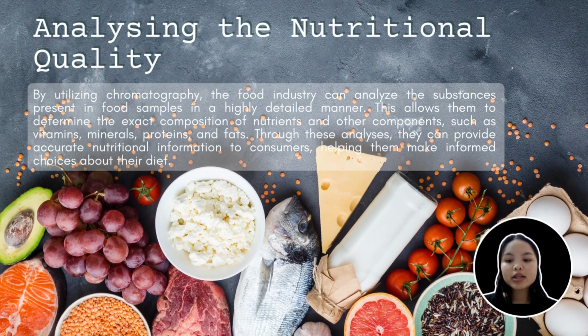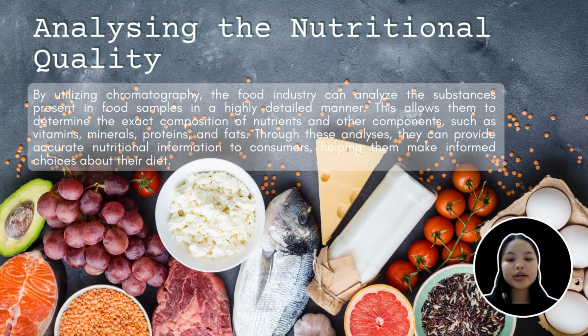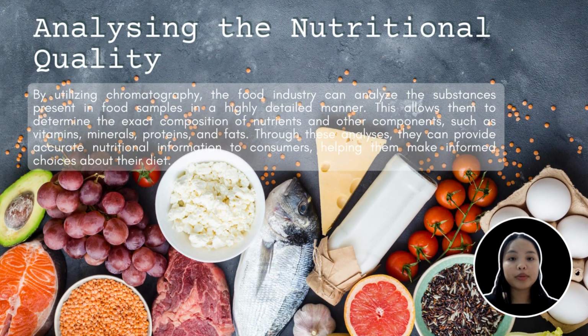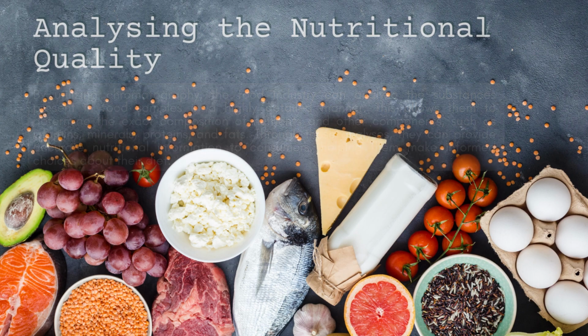By utilizing chromatography, the food industry can analyze the substances present in food samples in a highly detailed manner. This allows them to determine the exact composition of nutrients and other components such as vitamins, minerals, proteins, and fats. Through this analysis, they can provide accurate nutritional information to consumers, helping them make informed choices about their diet.